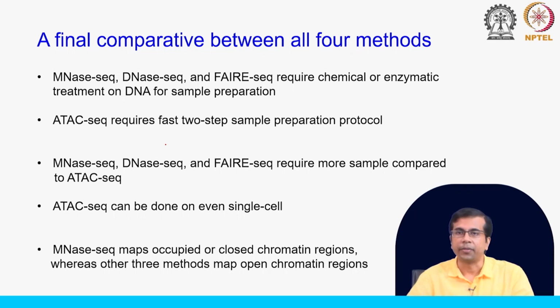Another difference we have seen is with MNase-seq. MNase-seq maps occupied or closed chromatin regions mostly. Because of the properties of the MNase enzyme, it chews up the DNA that is not bound by any protein, for example histones or transcription factors. So at the end we are left with DNA that is bound, and we actually sequence the occupied or closed region.